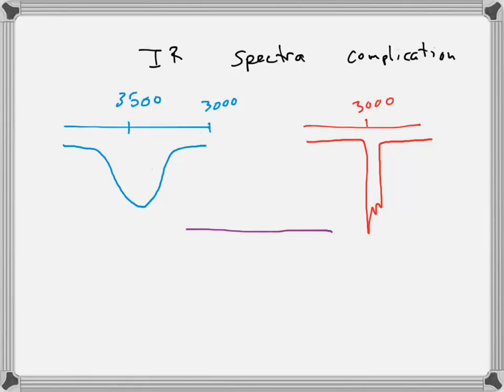So here's kind of a difficult concept in spectroscopy, and it shows its head kind of simply at first in IR. If we were to look at the two signals crudely drawn here, this nice broad peak, fairly intense, we might specify as an OH, particularly because it's centered at 3400. If we look at the red one, we're just under 3000, a sharp, intense peak. We're looking at CH sp3s.